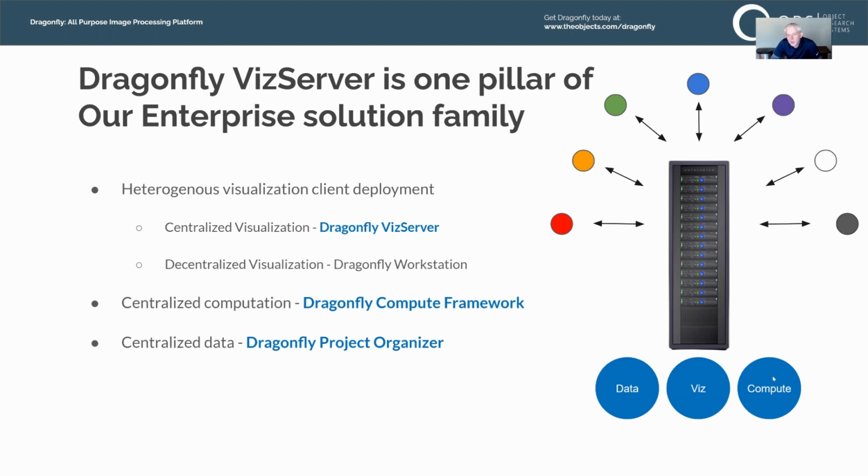This enterprise family allows organizations that have high image processing demand to be able to scale up their resources and use them intelligently across an organization where users can access remotely and have the benefit of centralized managed access to data, to visualization, and to compute capacity.